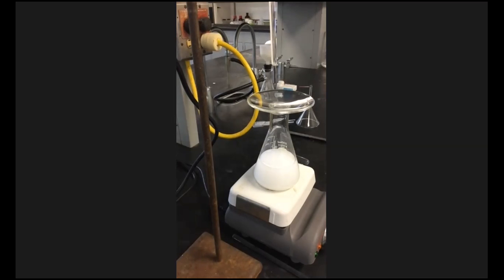We're gonna figure that out. We don't know yet. There's a test you can do for that. That's a great question. So let's think about it. I want y'all to be thinking in advance. All right. So with the limiting reactant, let's say we did the reaction and we added more calcium chloride.